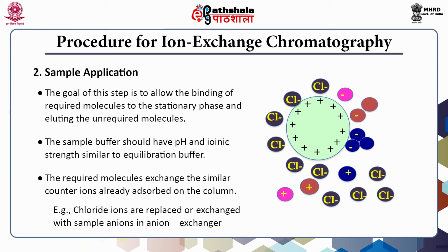In case of a cationic exchanger experiment, the negatively charged analytes and also the replaceable sodium ions will be eluted out, and the positively charged proteins are attached or adsorbed on the surface of the ion exchanger, which has negative charges on its surface.